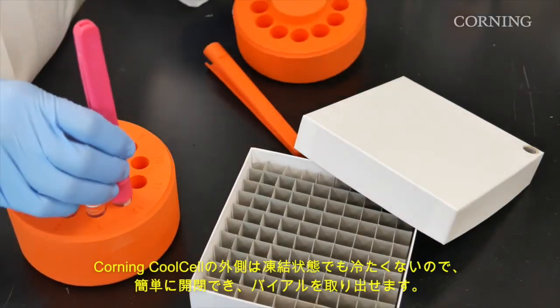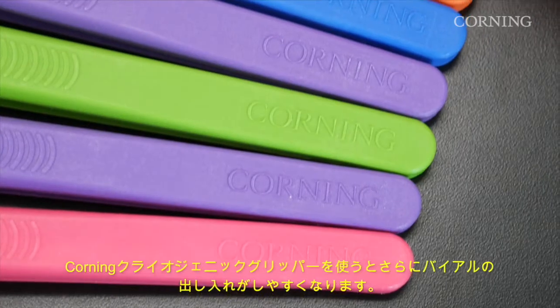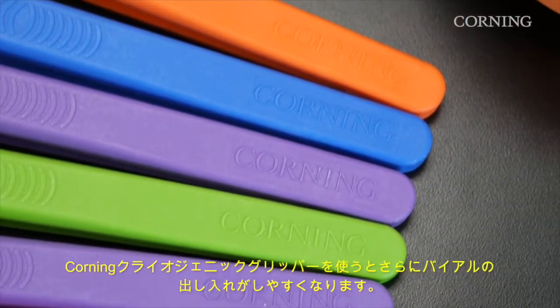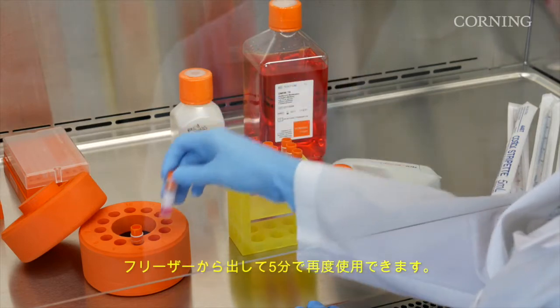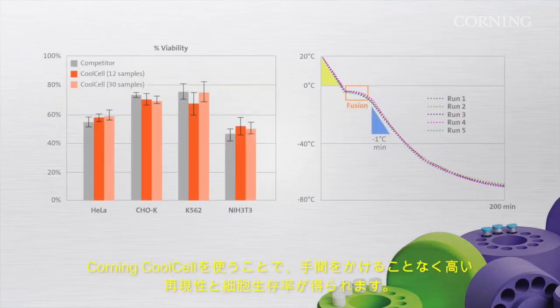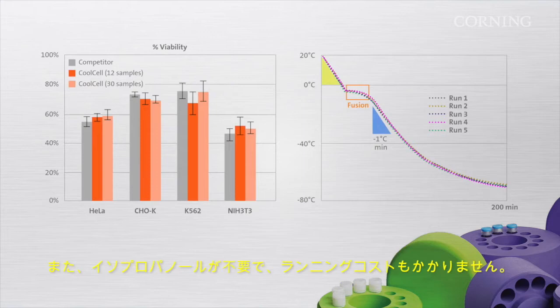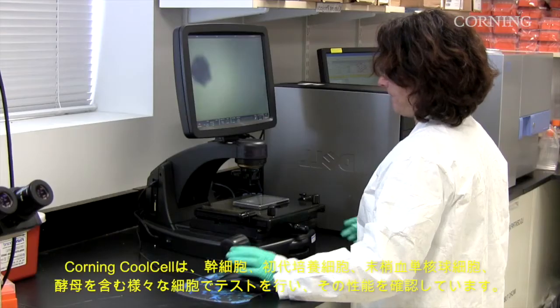Corning Cool Cell is not cold when frozen, so it is easy to open and remove vials. You can use Corning cryogenic grippers for easier handling. You can reuse the Corning Cool Cell after just five minutes. With Corning Cool Cell, you can count on high reproducibility and high cell viability without the inconvenience, ongoing costs, and mess of dealing with IPA.